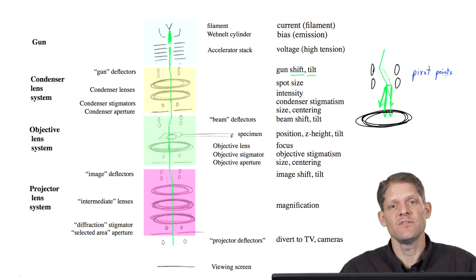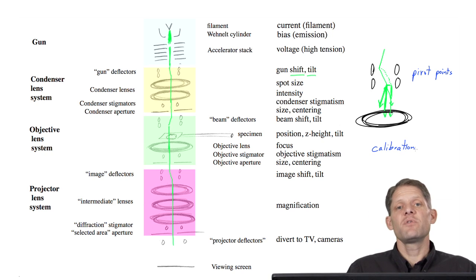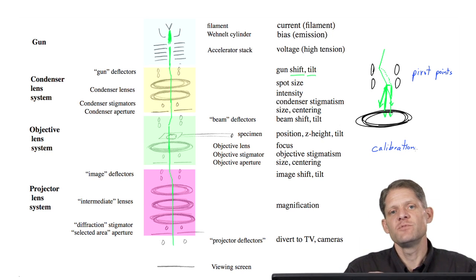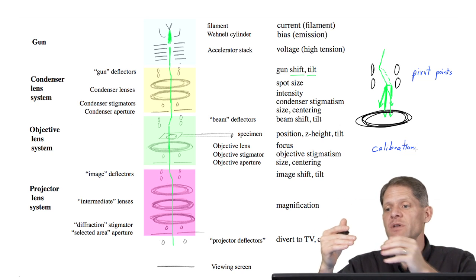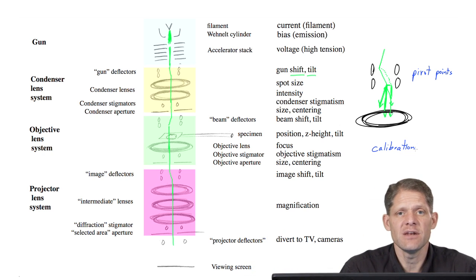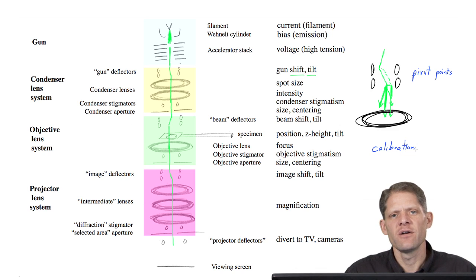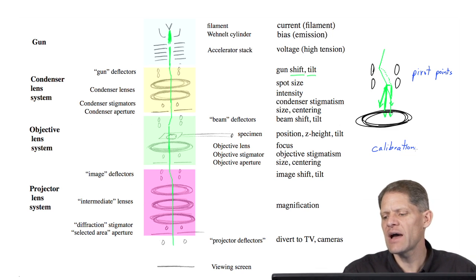Now, alignment is different than calibration. There are a number of software packages today that allow microscopes to take images automatically and then move on to another specimen and focus and take another picture and then move on and take another picture, all without any user needing to be there. These packages require that certain commands in the microscope be calibrated.